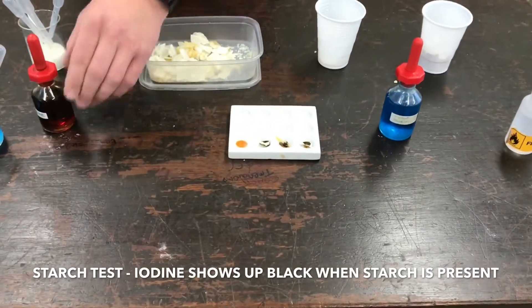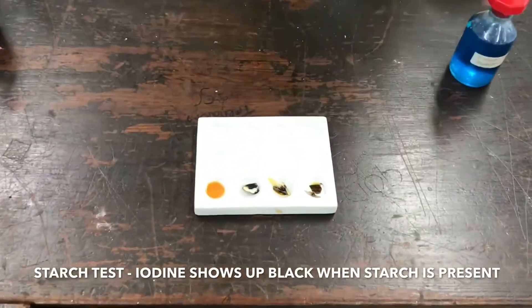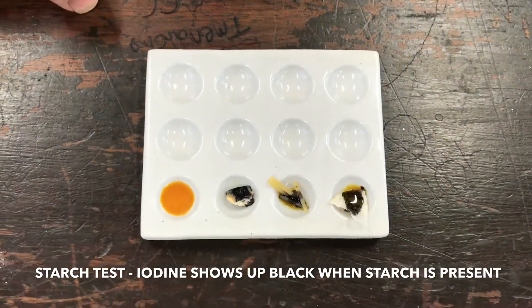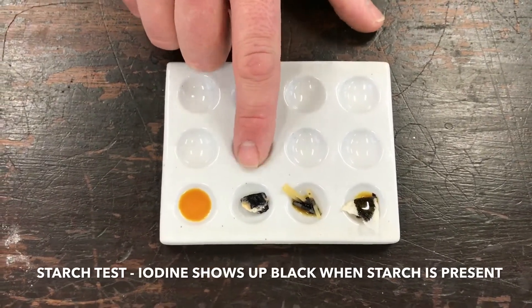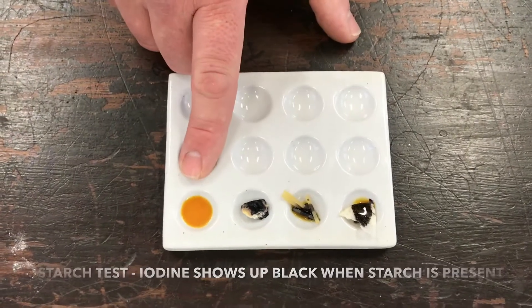Now if we have a look at these results, we call these results qualitative, not quantitative, because there is no number for the results. We are giving an opinion, and we can see that three of our test foods — our crisp, our pasta, and our biscuit — all contain starch, but our milk doesn't.